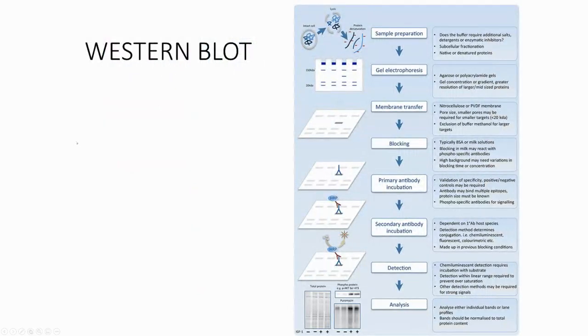So till now, that's the DNA, RNA analysis, nucleic acid analysis. And then for the protein, the most commonly used technique is called a Western blot. With the Western blot, you can separate the protein from a complex mixture through electrophoresis. And the protein separation basically is based on the size or the isoelectric point.